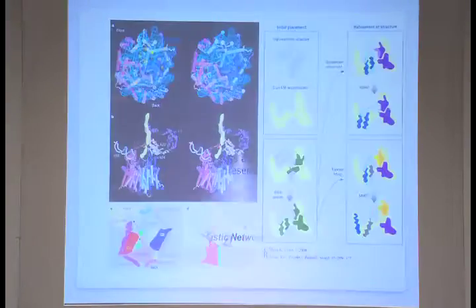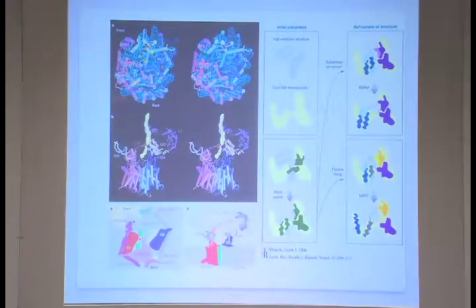So that's how they do it in this fitting method. And it was applied in some ribosome structure again. That was a SecYEG, a translocon bound ribosome. And there was a long controversy on the orientation of these helices of the SecYEG. And so in this normal mode based fitting, they could answer this.